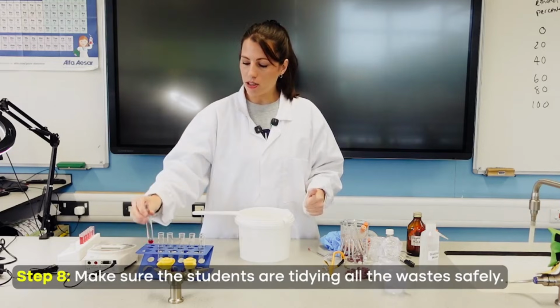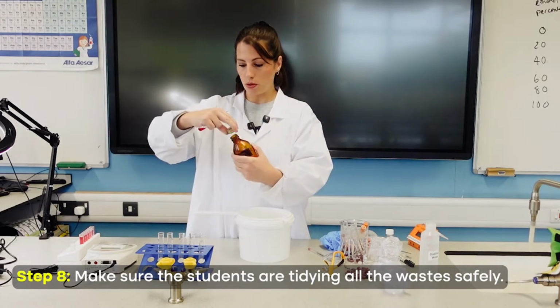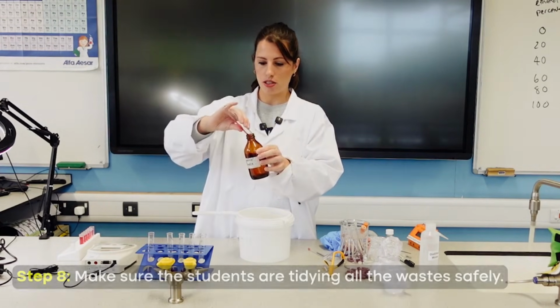So the final thing is making sure students are tidying all away safely. So their liquids will all need to be poured into the organic waste. And when I say liquids, that is their ethanol solutions.